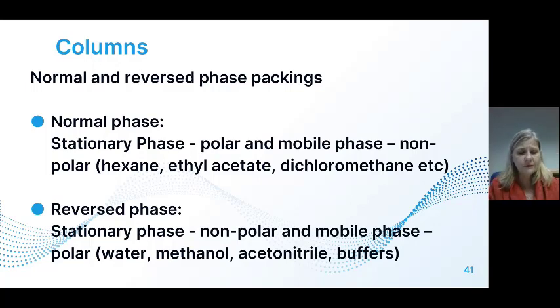So the stationary phase for reverse phase chromatography would be non-polar, and your mobile phase would be polar: water, methanol, acetonitrile, and buffers, once again going from very polar, which is your water, to a more non-polar, which is your acetonitrile.